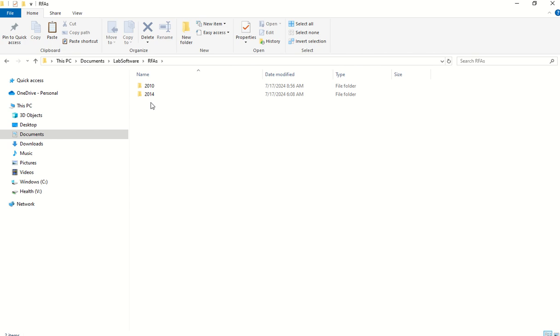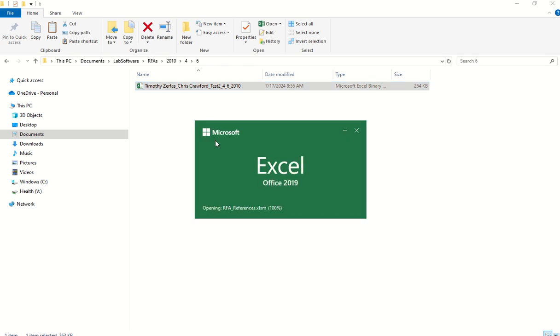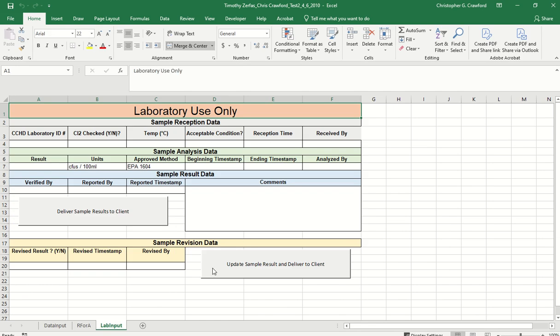All right, so what did we create? So we created this guy here. And you can see there's the sanitarian, the client, the location point, and the date. You guys are familiar with that. And we'll open it up. And now what you see is it goes immediately to the lab tab, okay? Because sanitarians are done, right? And from this point on, it's just laboratory stuff. So it goes to the lab tab.